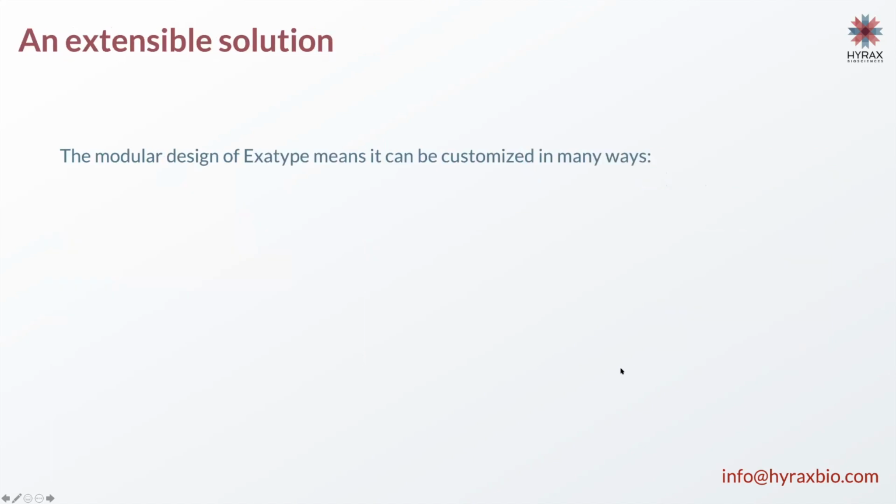And one thing to point out is that Exatype is essentially an extensible solution. So we have designed it in a modular fashion, which means that it can be customized in a broad range of ways. So when Imogen did the demo on our public front-facing solution, you saw that we had support for the 3 Arctic protocols. However, in the background, we do support a number of other protocols, and I'll touch upon that in a moment. But technically, it can be deployed to support absolutely any assay.